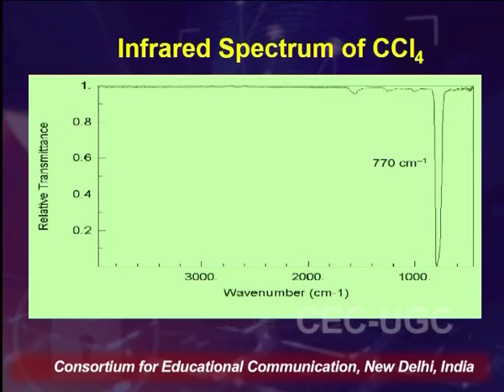Similarly, with the advent of various research techniques, we have seen where the different peaks of different molecules lie. Whenever we run an IR spectrum, there is a whole database and library of peaks of various chemicals and bonds, and we can identify the composition of the molecule we are analyzing.